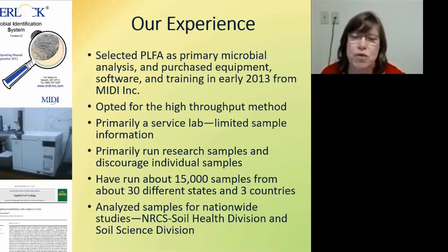They had just come out with the high throughput method. It was by Jeffrey Beyer, who worked at the Beltsville USDA Agricultural Research Service, and he worked closely with MIDI on a high throughput method. So instead of the extraction taking 4 days, it took just 2. So we went with that method, and that's what we've been doing ever since.